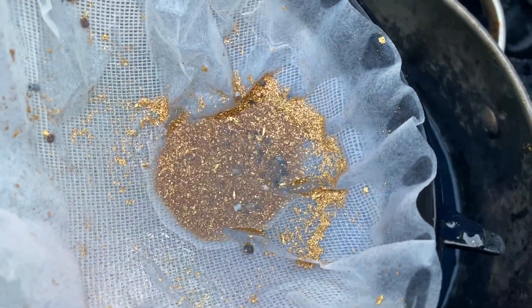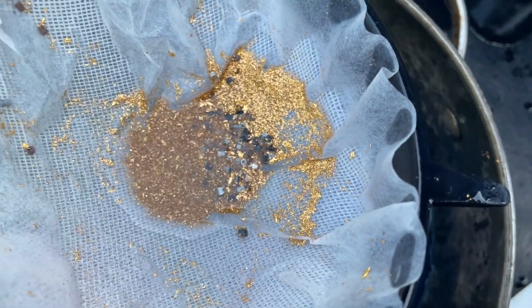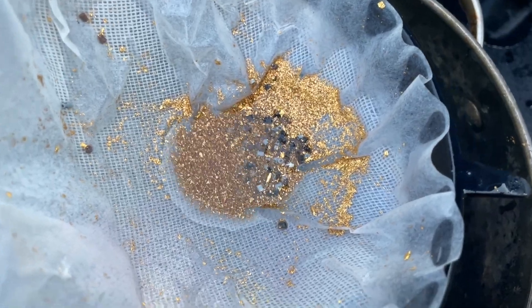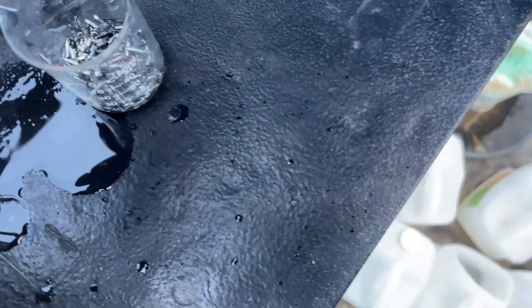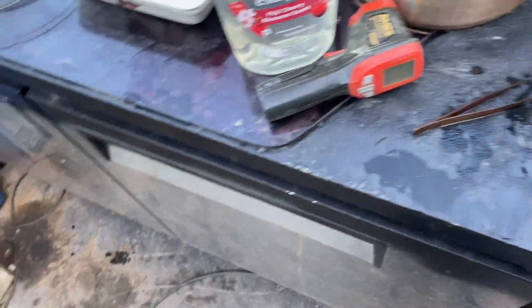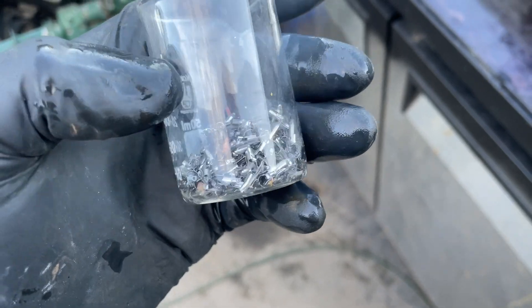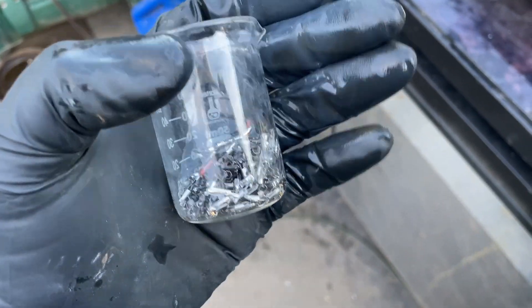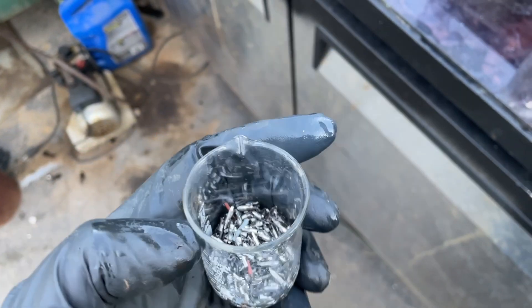There are a couple of pieces of plastic in there still and some little black things. I'm not going to pull them all out because they might have gold in them. I don't think aqua regia will do anything to them. I got out all the little stainless pieces — that was a pretty good chore. There might be a flake or two of gold in there but not much.